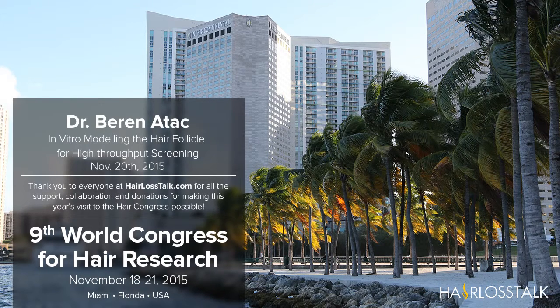So the direction we are going, eventually, is to vascularize the tissue to prolong the duration and make long-term substance testing possible. But in this case, we start with endothelium integration, so it is a co-culture with endothelial cells and the hair tissue. Now you are looking at one culture compartment of the multi-organ chip at day 0. There are about 120 of these organoids, and you can see them at day 7.